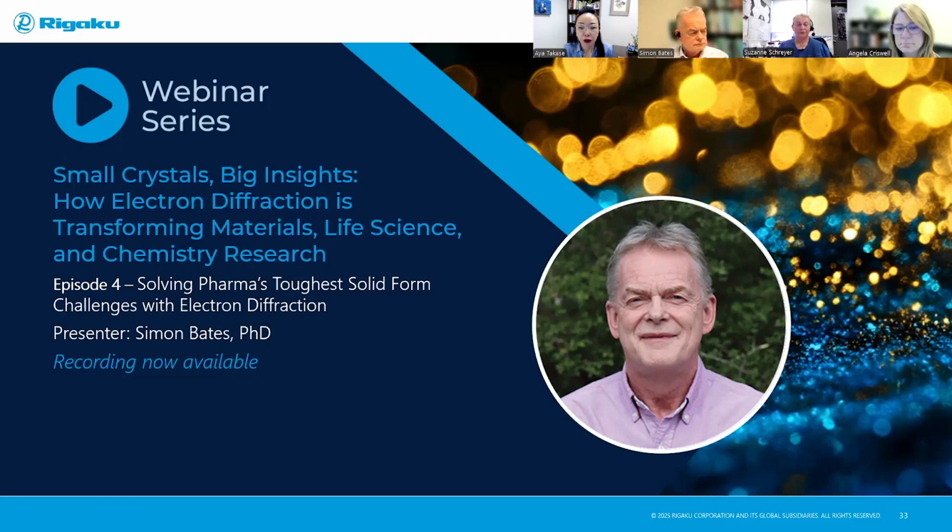But one of the techniques we briefly mentioned but didn't go deep into is the electron diffraction. And in a different webinar series, our co-presenter Simon gave an in-depth look into how electron diffraction, or micro-ED, people call it different names, is solving very tough problems for the pharmaceutical industry. If you're interested, you can watch the recording now. I'm gonna put the link to the recording page in the chat too. So if you are interested in it, please take a look.